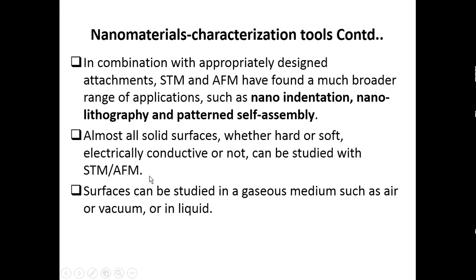In scanning electron microscope and transmission electron microscope, this is not possible, because in scanning electron microscope, the sample must be a conductive sample. That is very important. Here, the sample need not be electrically conductive. You can use an insulator material to know its surface characterization. That is possible.